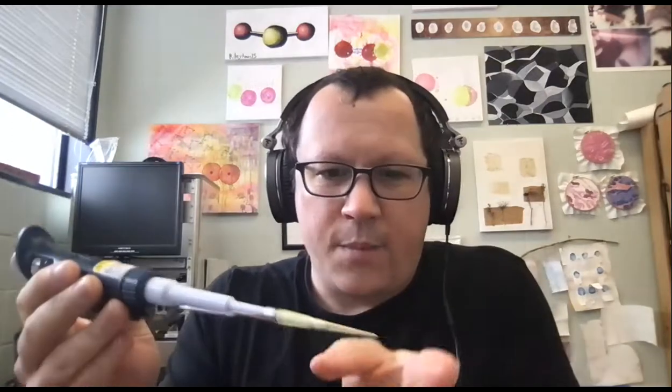So, to change the volume, meaning how much liquid we pull up into that tip, we rotate knobs. Each pipette has knobs up at the top of it like that. We don't rotate the plunger.